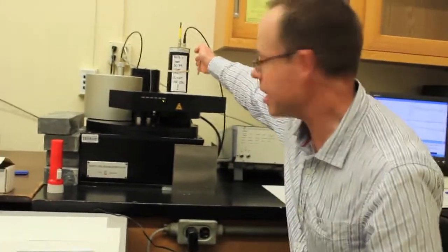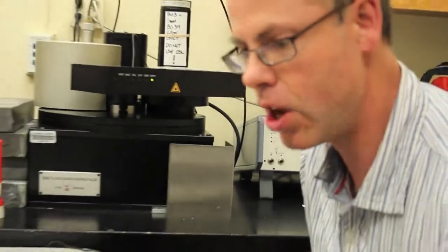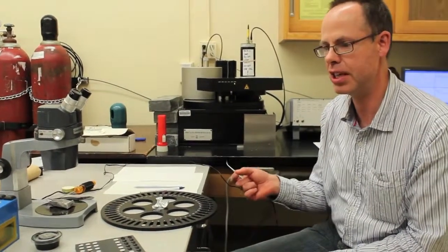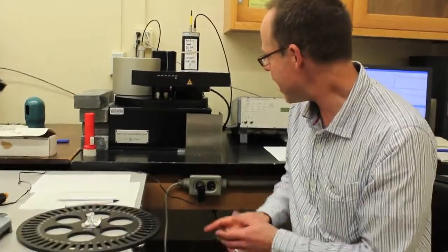We collect it in this very sensitive light detector, and this is passed through to the electronics, and that passes the signal through to the computer where it's stored. We make a number of measurements on the same sample, and that allows us to compare the magnitude of the natural signal that we observed. So the first signal we measured was produced by the sample interacting with environmental radiation whilst it was buried in the ground, we compare that with the radiation that we induce in the laboratory.